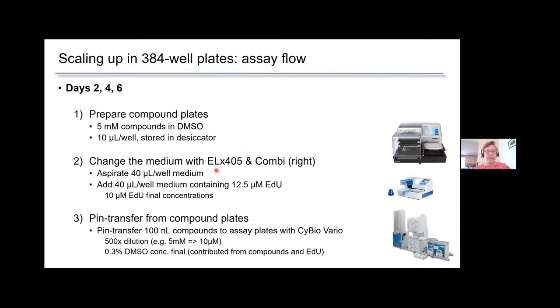So we changed the media to one containing EdU as well. And what we use is called the ELx405, from BioTek. Again, it's in the protocol.